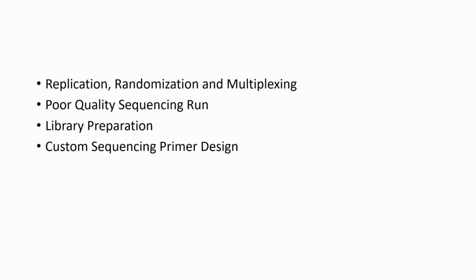Basically, replicates are essential in any biological experiment. For sequencing, we also need to have replication, and samples are subject to variation, which makes biological replicates important for statistical significance. And randomization: basically, you can reduce the instrument effect, systemic bias, and the potential for the occurrence and effect of confounding factors.